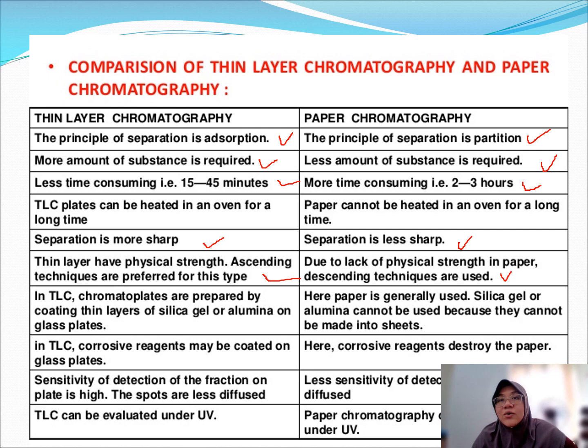So next type of chromatography kita akan highlighted next on week 10. Alright, so thank you. I hope you understand well on this chapter, especially the chromatography. Okay, and this chromatography technique, the paper chromatography and thin layer chromatography, only will be held after you do the extraction process. Okay, so extraction pun dah explain. Then the chromatography technique.